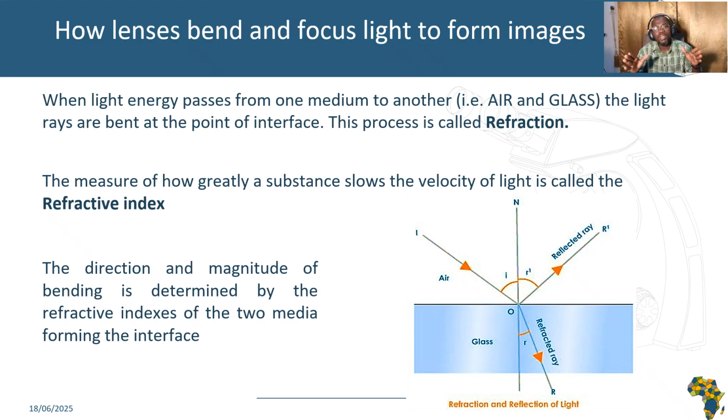This occurs because light changes speed when it moves between different media. Every material has its own power for bending light, and this is called refractive index. The common materials used in microscopy are air, oil emulsion, glasses, and many more. Each of these substances has a different capacity to bend light, and that is called refractive index.